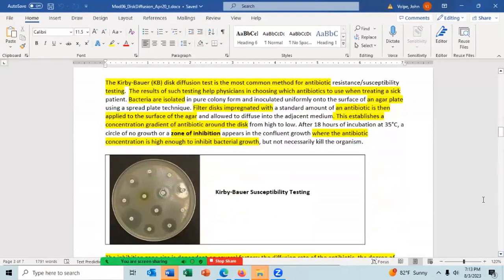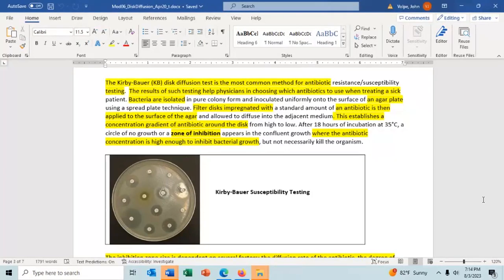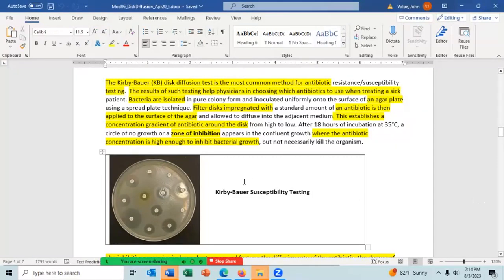The Kirby-Bauer disk diffusion test is the most commonly used method for antibiotic testing. The results often help a physician choose which antibiotic to use when treating a sick patient. Bacteria are isolated from the patient, grown on an agar plate, and filtered discs impregnated with antibiotics are applied to the agar. The antibiotic establishes a concentration gradient, and the plate is incubated for 18 hours at 35 degrees to allow the bacteria to grow.